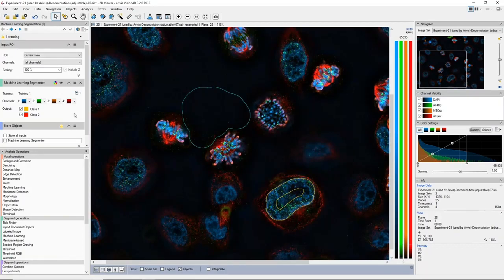There's many things we want to show you, maybe in our next webinar, with regards to the new Magic Wand tool, for example. Some of the really nice enhancements we've added to the 4D viewer, like the ability to create color legends for object coloring. You may remember from previous webinars that you can color objects according to features, and now you can actually have a legend directly in the image to explain what the color means.